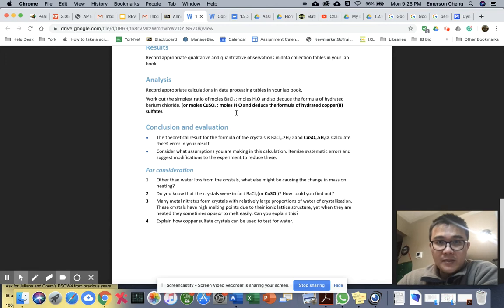And if you remember from past half unit tests, you talk about potential reasons why mass might be lost, such as during the transfer, where some of the powder might have been lost, maybe to wind or something along that line. So some of the mass might be lost due to that.